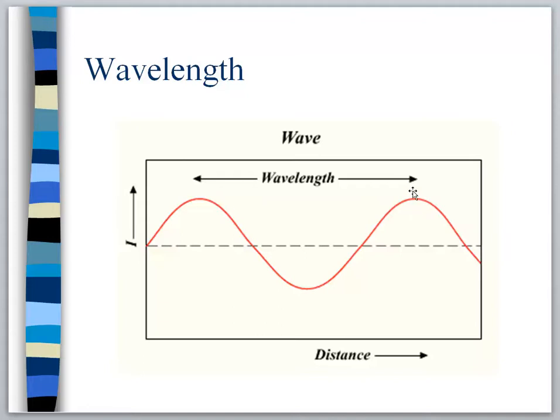If that number falls between 200 to 400, that number is classified as UV. If that number goes between 400 to 900, that's kind of where we put our cutoff, that is classified as visible. And again, keep in mind that these numbers are rounded and they're cut clean, meaning UV really does go below 200. We're rounding it off to 200 for convenience.